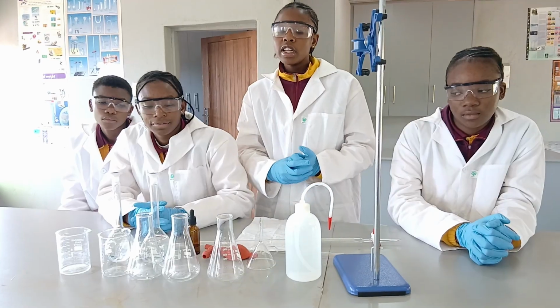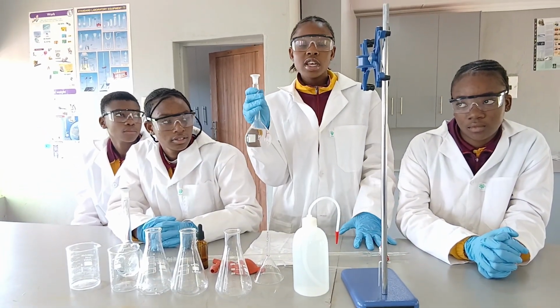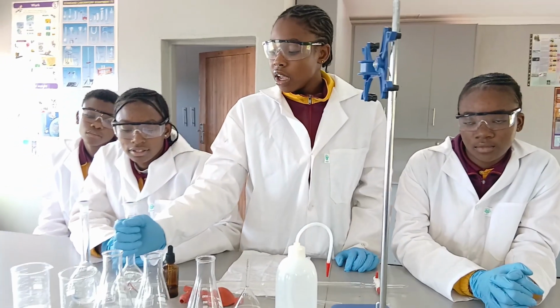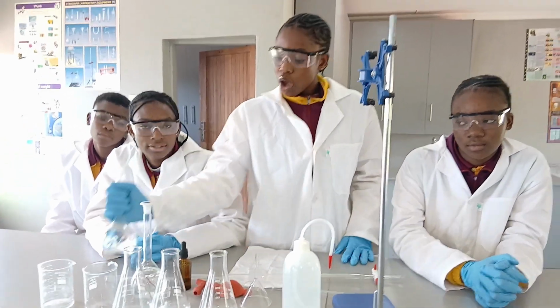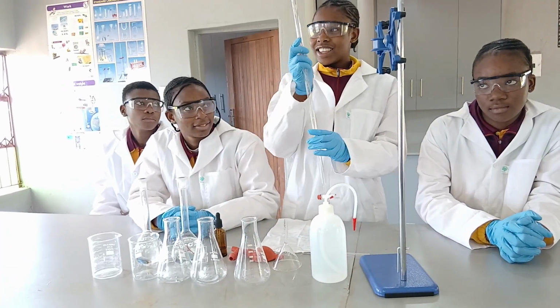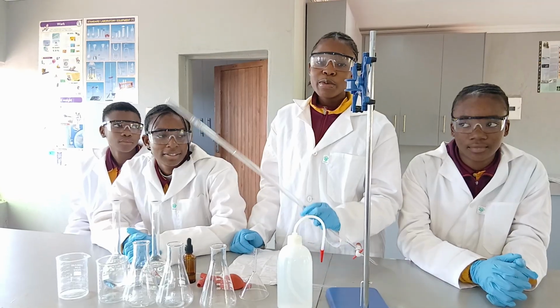We also have two solutions that were prepared. The first one is hydrochloric acid, which we labeled A. Then our solution B is sodium hydroxide. Now we are going to mount the burette on the burette stand.